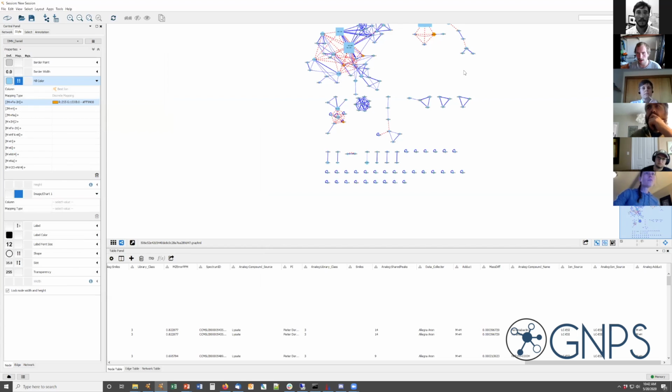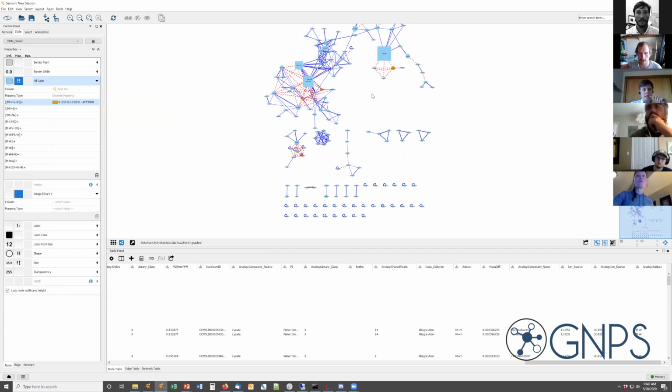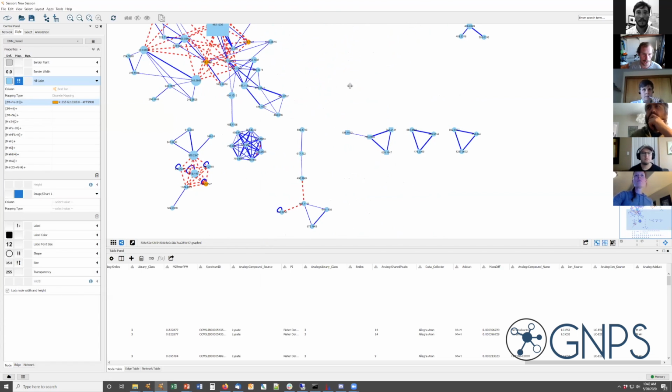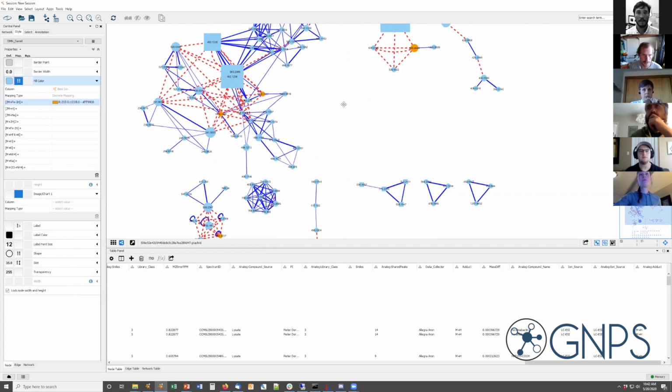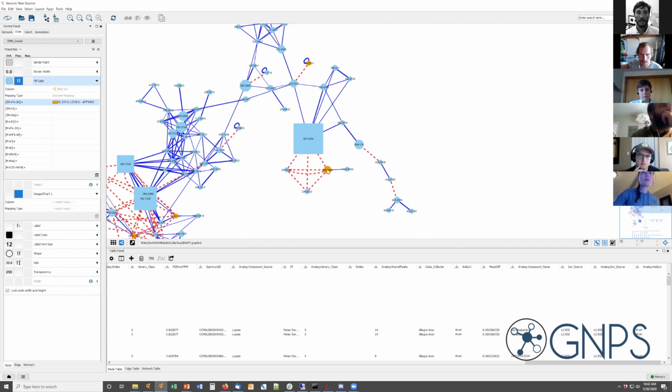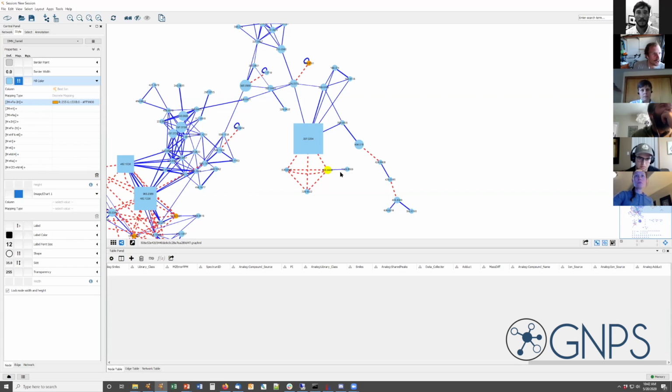Okay. And then I had to remove the pie charts. And then I see already inside of my network now, if I zoom in, which nodes are actually orange, right? And then I would see here, oh, there's an orange one. And here I had another mapper. Let me talk about that really quick.